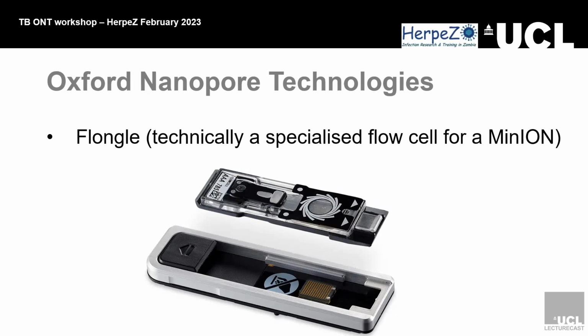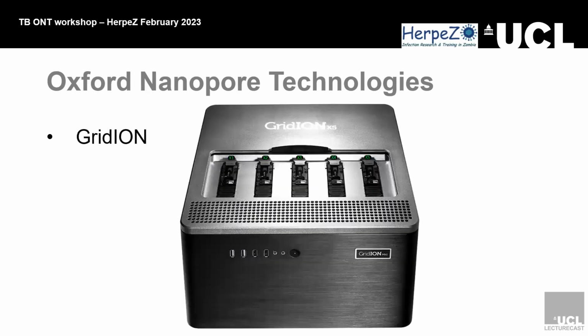And then you have the GridION, which is like a bunch of MinIONs run together. With this one, you can do hundreds of samples. It's also got a really powerful GPU computer in it, so it's an integrated system platform.